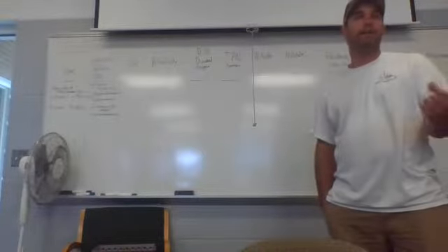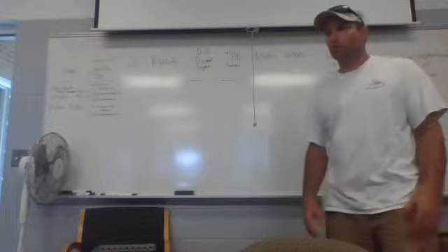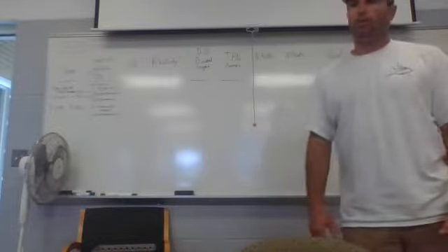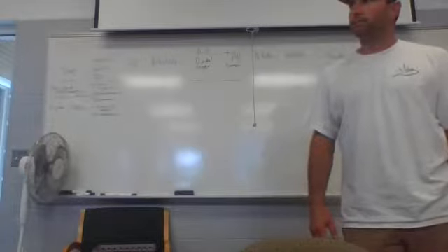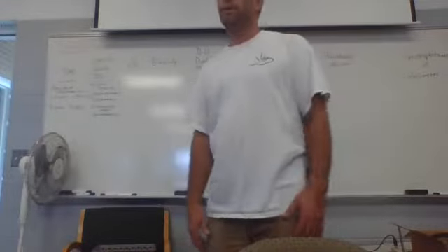Yeah. Like TDS and the color, the actual turbidity of the water is definitely something you can just directly measure with the spectrophotometer. And also, I threw up there versus colorimeter, which is a similar kind of thing. Do you have one or want to say anything about it? This one is a colorimeter actually, and the larger one is a spectrophotometer.